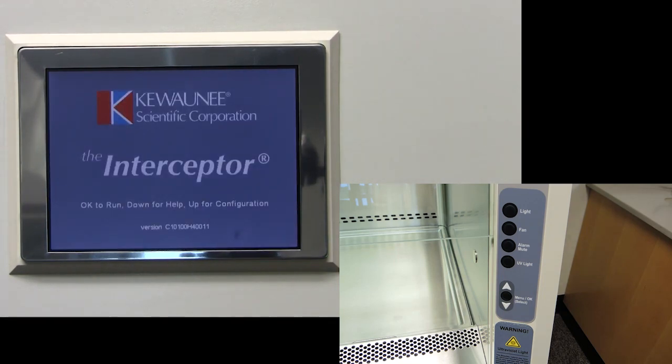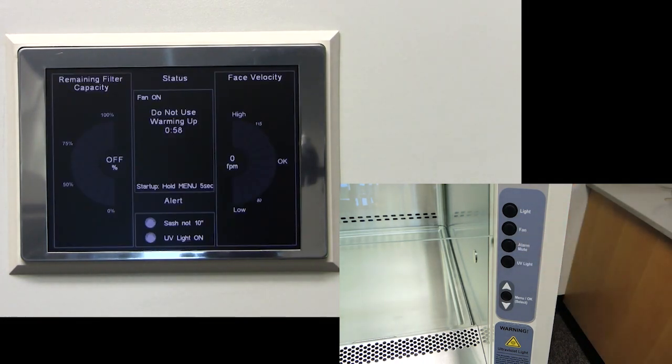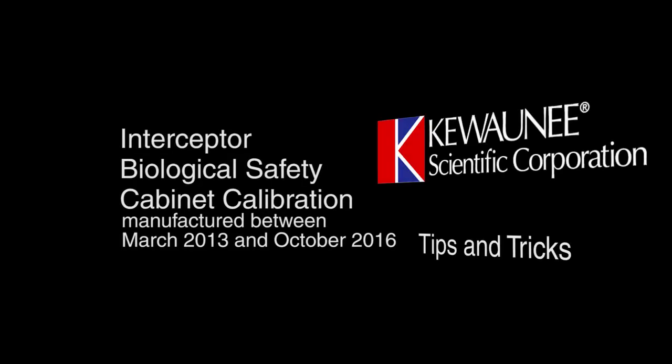Your screen is now calibrated. You can press menu slash OK, turn on the fan, and allow your cabinet to ramp up for use. This has been Kiwani Scientific Tips and Tricks.